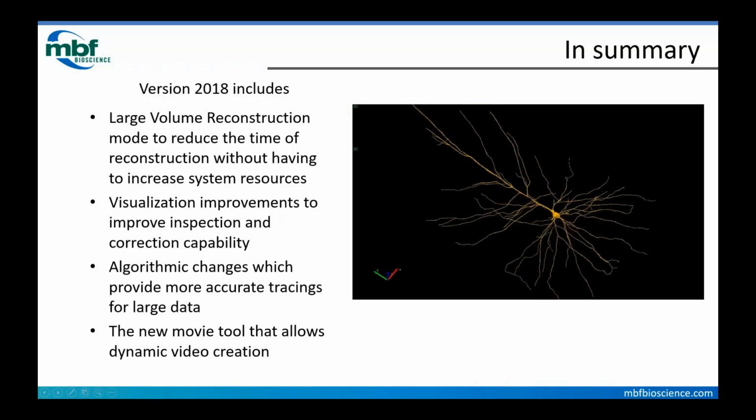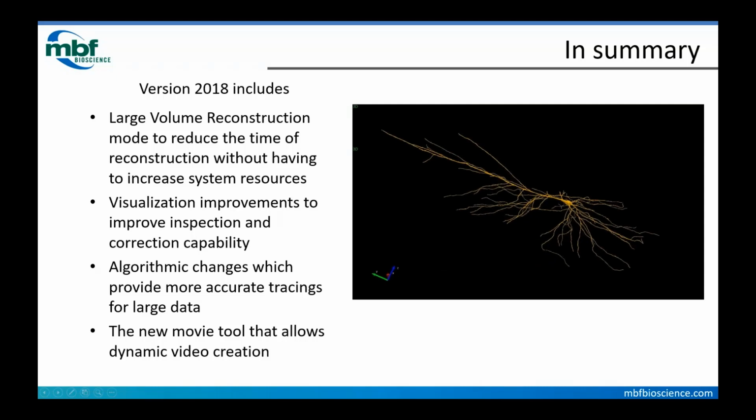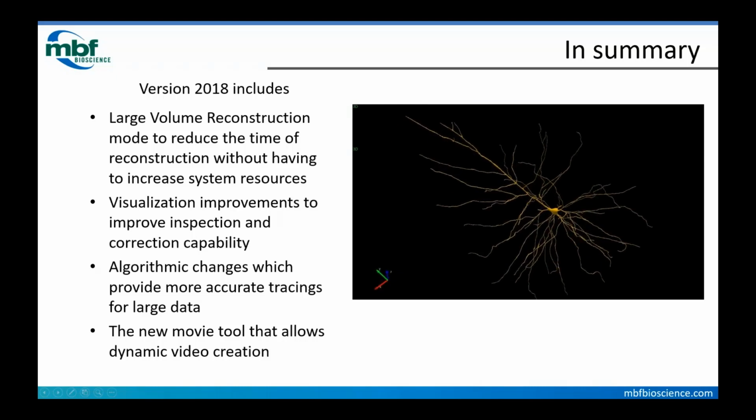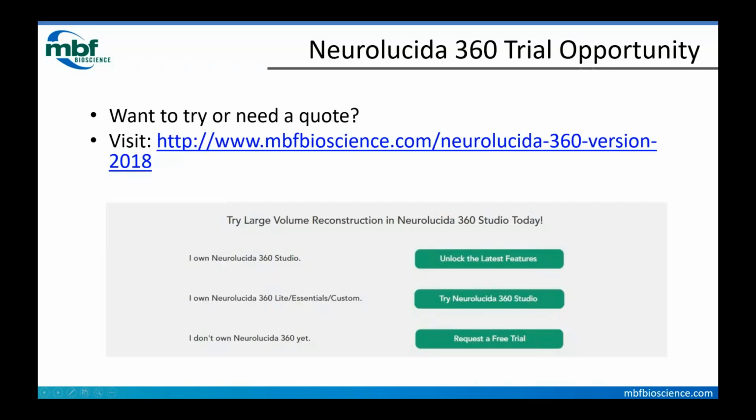If you're a current user, I hope this webinar serves as a way to help you best utilize what we're creating for you. And if you're interested in Neurolucida 360 but haven't used the software, we invite you to try it today.